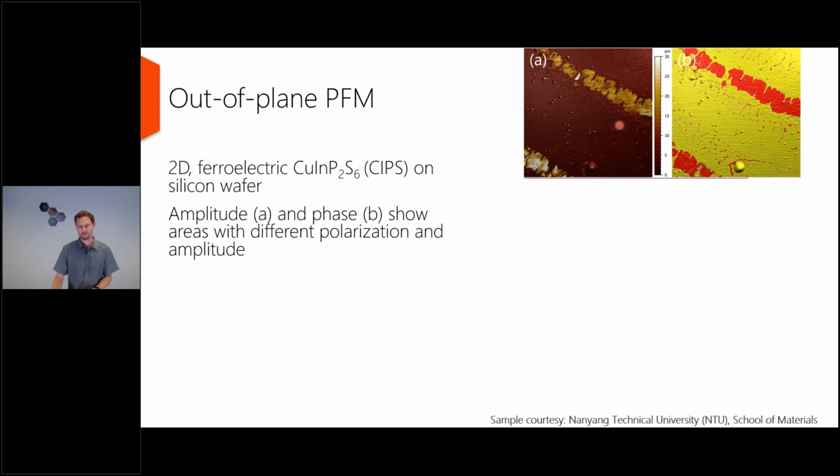In brownish, a very low amplitude; yellow, white, a much higher amplitude. And on the right, again with the yellow-red scaling, the phase. It was nicely, again, a 180 degrees phase shift. And I used here the normal deflection sensitivity, which you can either record with force spectroscopy or contactless, combining Sader and the equipartition theorem. And you see that the amplitudes are in the tens of picometer range.